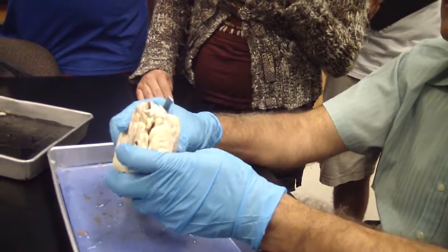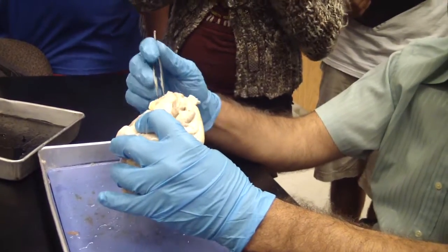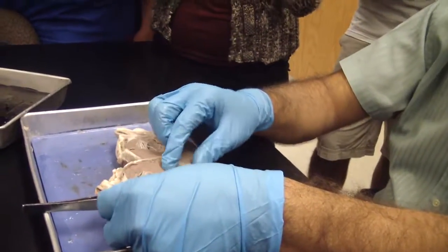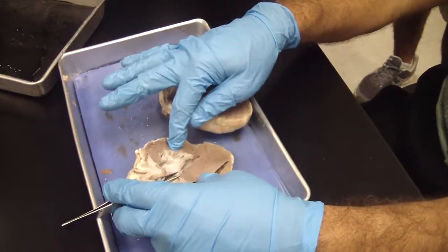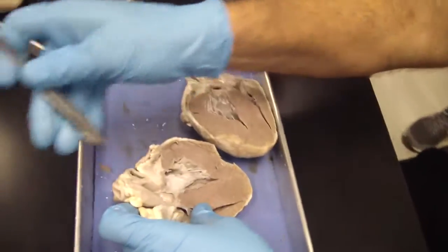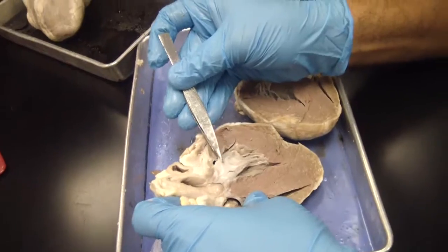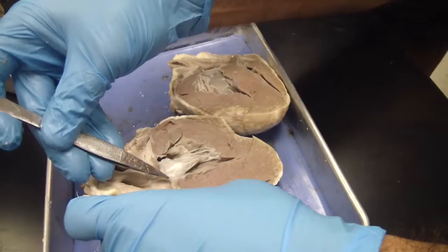Let's see if we can at least see the aortic semilunar valve. Here's the aorta, and remember that was the brachiocephalic. So remember, this is the left ventricle, correct? And then the aorta goes out. So this right here, at least we can see the aortic semilunar valve. No, remember this is the bicuspid mitral valve, but this stuff right here would be the aortic semilunar valve.